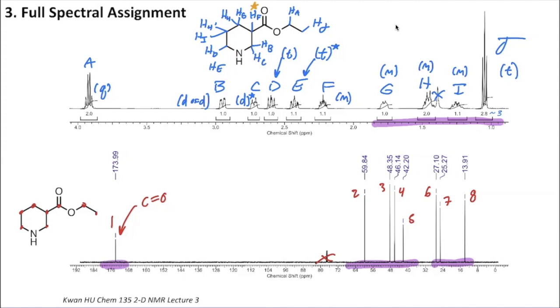The other proton we might want to look at would be maybe HB or HC. I'm going to say HC to start because we left this sort of asterisk here with our assignment for the splitting on peak C. It looks like maybe it's more complex than a doublet. And based on the place that we put it in our molecule, it should really look kind of a lot like B. It doesn't look as much like B as I'm expecting. Again, go see that other video to think more deeply about the fine detail splitting we would expect to see in the 1D NMR. So those are just 2 to start with. You can start anywhere. All right, so we'll target HF and HC in our COSY.